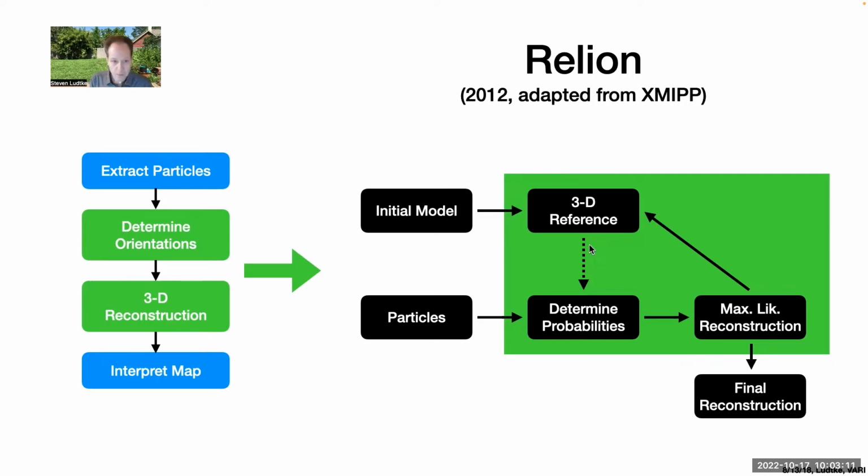There are a number of questions about what Relion is doing, whether it's actually maximum likelihood or not, but regardless of the mathematical arguments, it produces very nice structures. That has become sort of the standard in the field now, doing these maximum likelihood reconstructions, along with CryoSPARC, which doesn't do maximum likelihood. It uses stochastic gradient descent, but runs very quickly and is very automated.